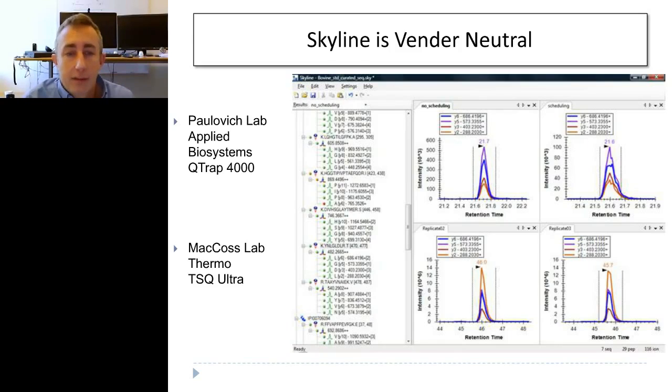This is the data from the Q-Trap, and this is data from our triple quad instrument. And you can notice that there are some slight differences in the data. We were able to look for the first time ever at the same different peptides between different instrument platforms. We were able to use the same signal processing tools to get quantitative data from both of them. This was really a game changer, and it was shocking to us that no one had done something like this earlier.